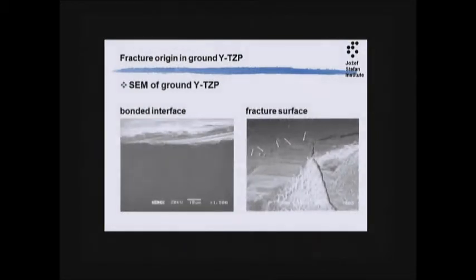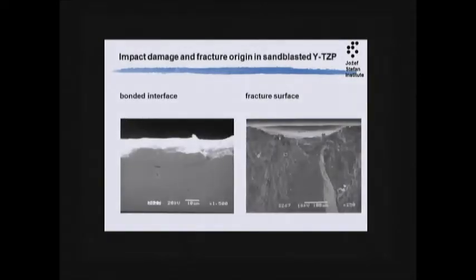I'm thinking that because we could not find any cracks using the bonded interface technique, two polished surfaces stuck together and ground on the surface perpendicular to that. No cracks seen here, but we will typically see the side cracks from this biaxial test pellets for testing. In contrast, in the sandblasted samples, we were able to see these lateral cracks.